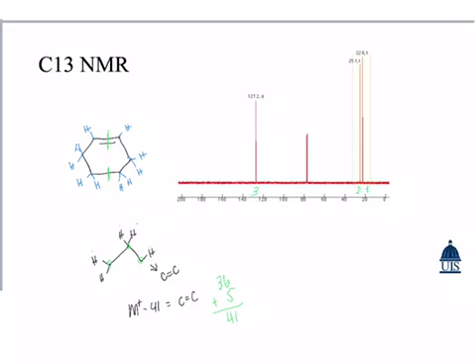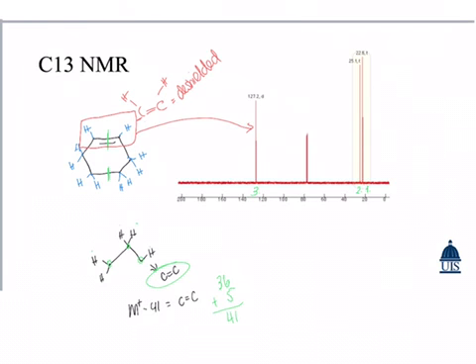Now that we have confirmed the presence of the double bond, we can match the different carbon environments with our image. The first carbon environment that we see is this one right here, because it has the double bond, and each carbon in this part of the structure has just 1 hydrogen attached to it, meaning it was deshielded, so it's going to be the farthest away from the other peaks, matching up with carbon environment number 3.